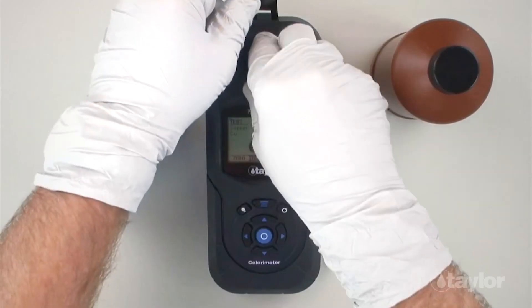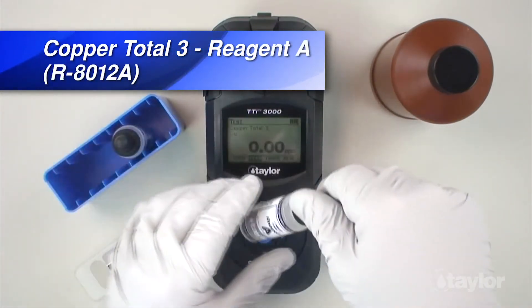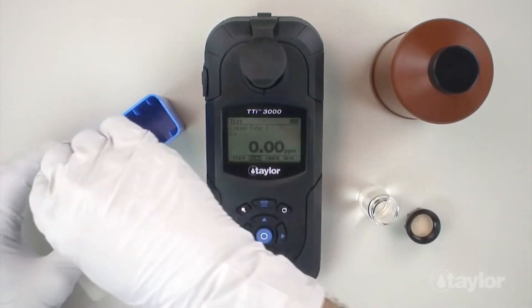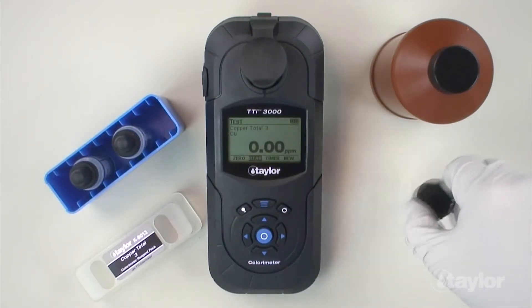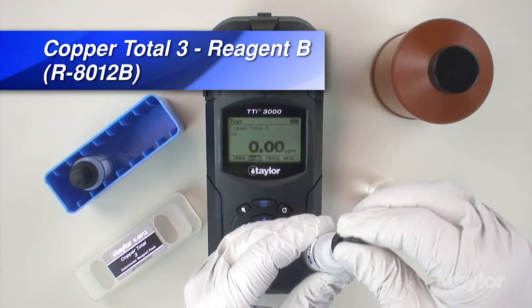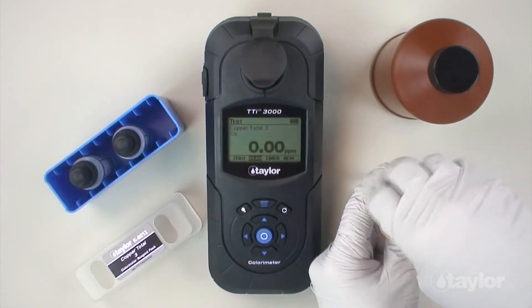Remove the sample cell from the sample cell compartment, then remove the cap. Add 0.5 ml Copper Total 3 Reagent A, and then swirl to mix. Add 0.5 ml Copper Total 3 Reagent B. Cap and swirl to mix thoroughly.